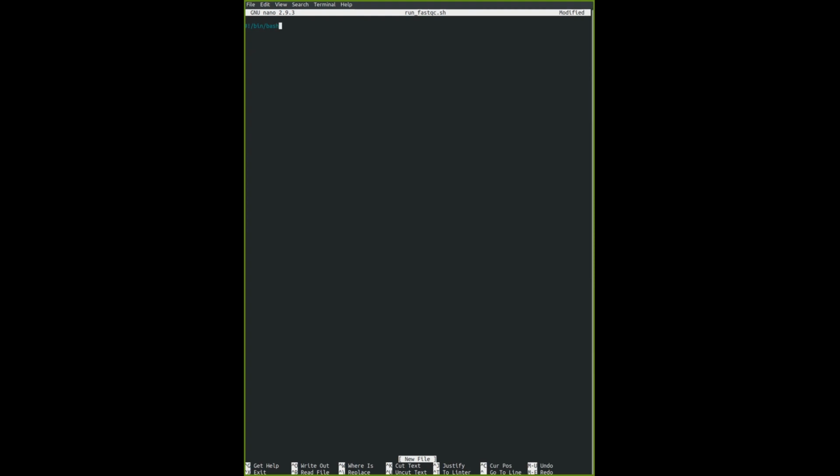It doesn't mean anything. It doesn't invoke anything because it's a hash, so it's a comment. But if you open up a lot of shell files, they do start with this, and I like to keep it as such, because it might come in handy in the future, right?